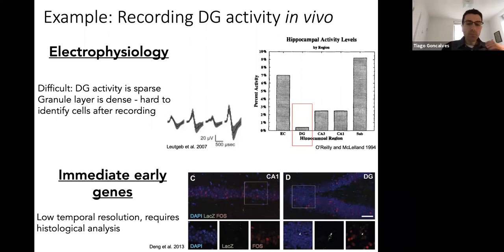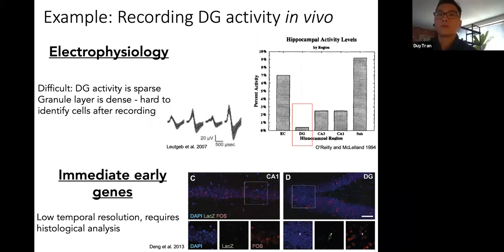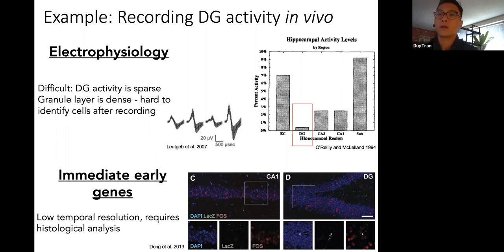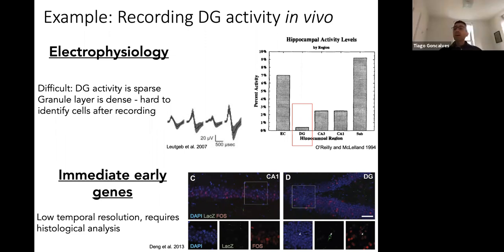Now, this poses a problem for electrophysiology. Why is that? Guys, does anyone want to tell me? Why is it a problem for electrophysiology when you have only a few cells that are here and there, spread a little bit over? Yeah. Someone is saying something? Because I think if you put the electrode in, it seems like you're not recording from any neurons, but they are there, they're just not active. So you can't detect them. That's exactly what the problem is.